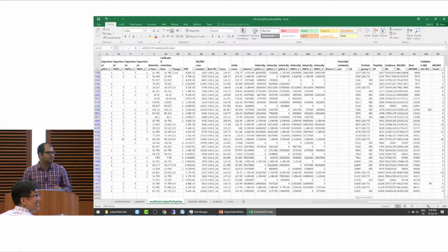So if I want to look at the modified peptide LFQ intensity, how do I do that? At the moment, there is no LFQ intensity reported for modified peptides. So for example, even for the phospho, you just use the intensity as such. You don't have any LFQ intensity.